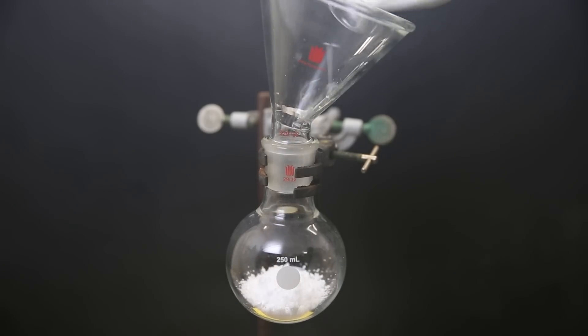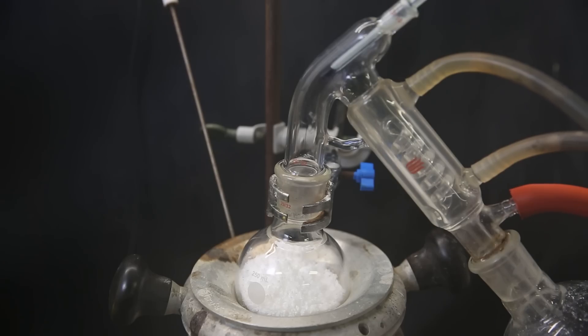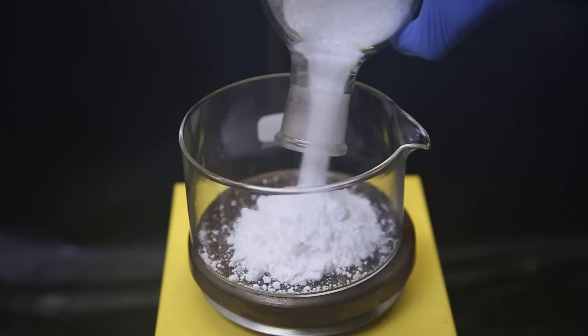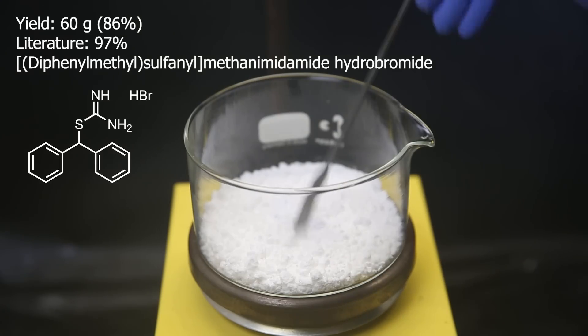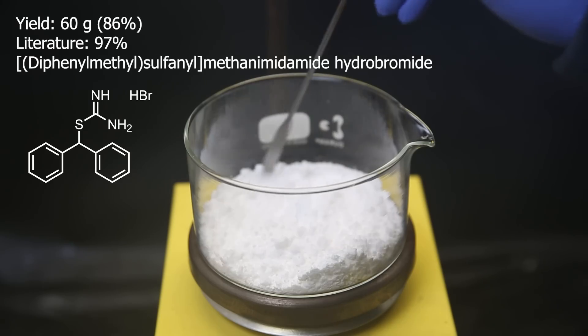So to dry it, I pour it all out into this flask, heat it lightly, and attach a short path distillation apparatus on which I pull a vacuum. I leave that overnight and it should pull out pretty much all of the water that is inside. When that's done, it is a dry powder that can be poured easily, in the end leaving me with 60 grams of the first product, which is a fair yield of 86%. Now that this part is finished, I set it aside while I prepare the second required reagent.